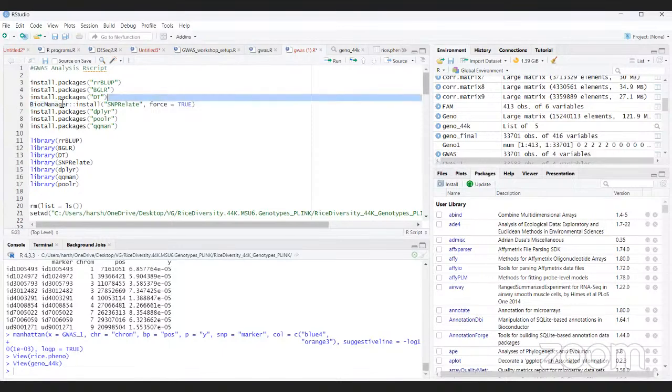This is a wrapper, or let's say an API tool kind of thing, which brings all your Bioconductor packages into R, right? This manages all the Bioconductor packages. So if you have installed BiocManager, then through BiocManager, by giving this command, you can install the Bioconductor packages.